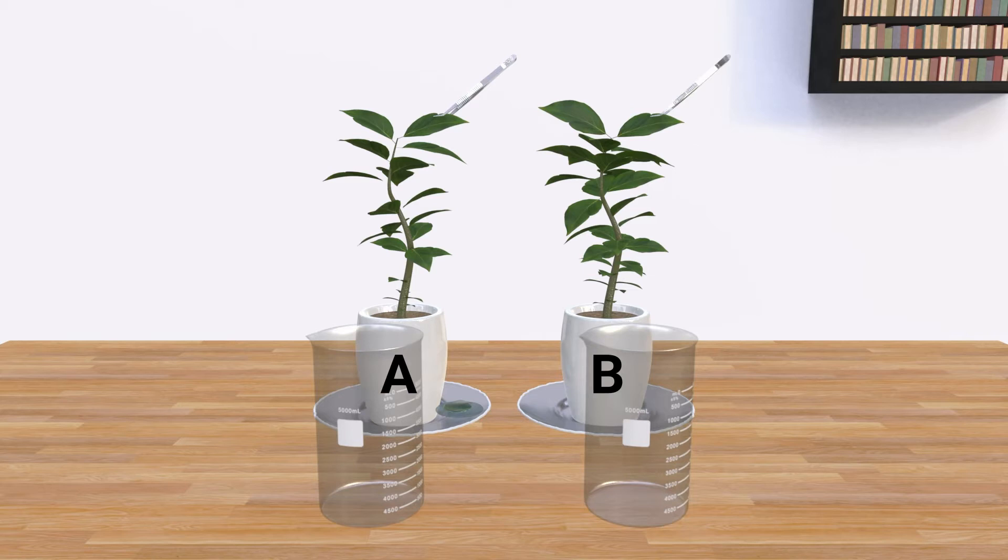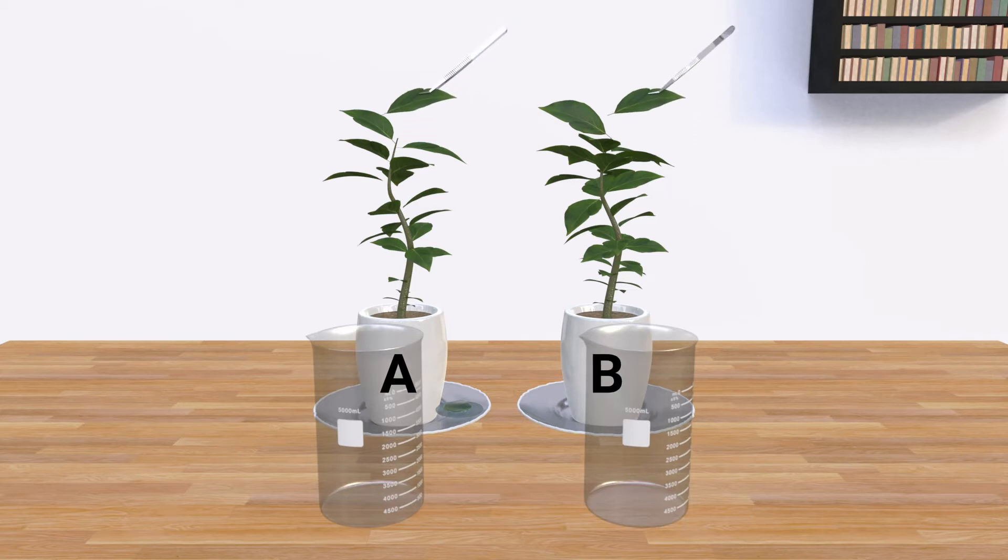Pluck a leaf from each plant and place it in a separate beaker and add ethyl alcohol to each beaker.